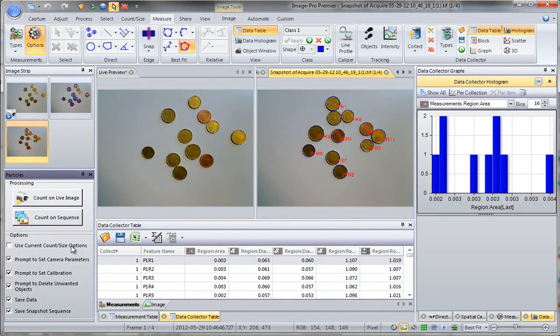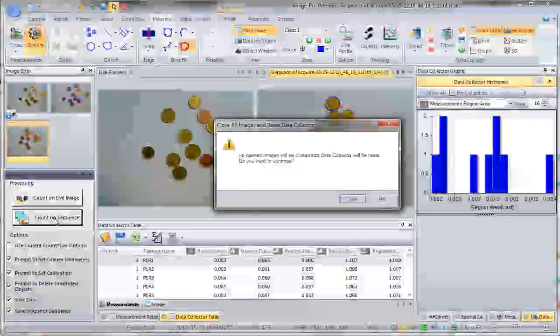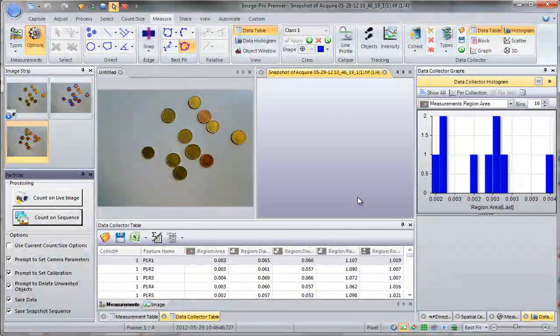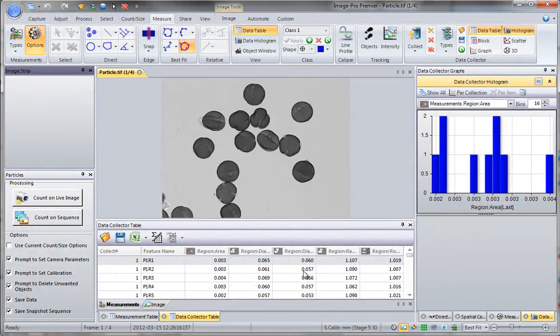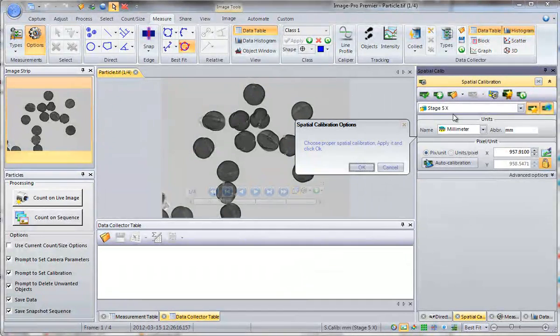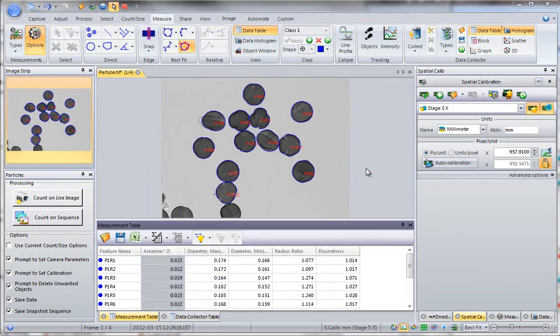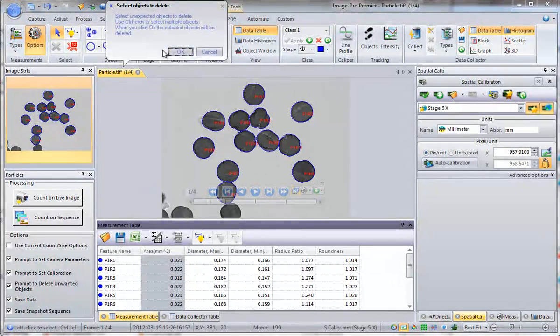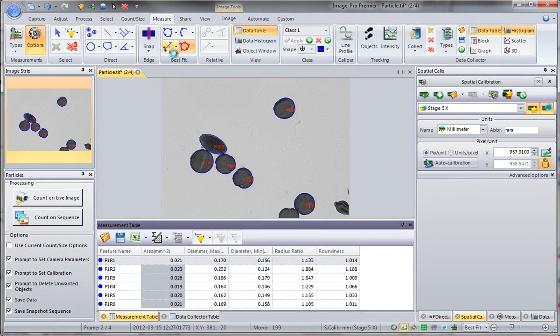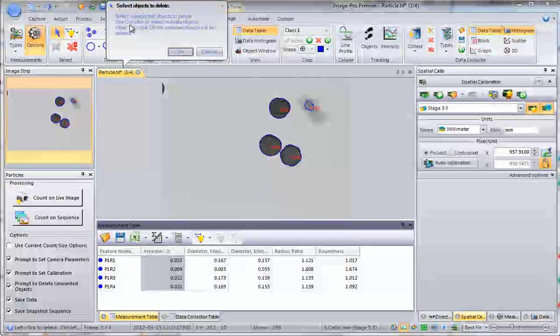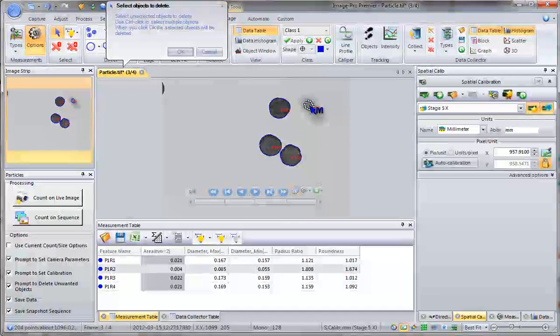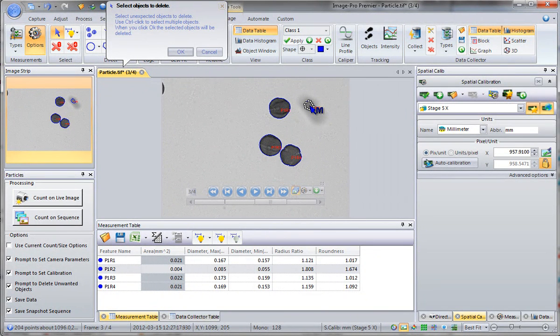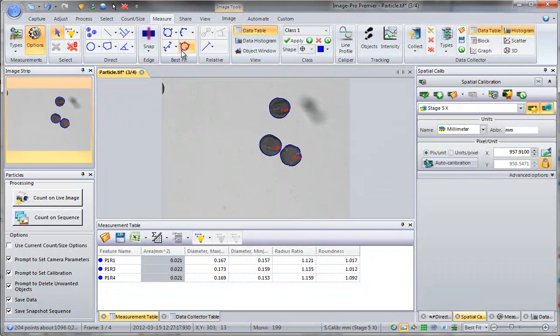Next I will show you how to count objects on a sequence. Simply click 'Count Object on Sequence.' You get the same prompt, then you are prompted to load a test image. You choose proper calibration, the object to count is separated — click OK. Separated properly — click OK. Here is a prompt to delete unwanted objects. You can select objects, and if you have multiple unwanted objects, use Ctrl+click. Then click OK and the objects will be deleted.